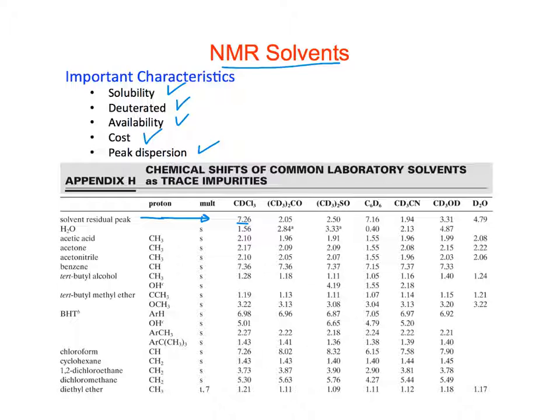And that's the expensive methanol, right? Because you can do CH3OD, and that's a cheaper methanol. But that methanol isn't good as an NMR solvent. It might be good if you just want to do a chemical exchange. But if you're going to use it as an NMR solvent, you'd like that methyl group to be deuterated as well, or else it's going to give a huge methyl group in the proton spectrum. Likewise, you can have CD3OH, but usually you want D4 methanol as an NMR solvent. That's the expensive one in the ampules usually.